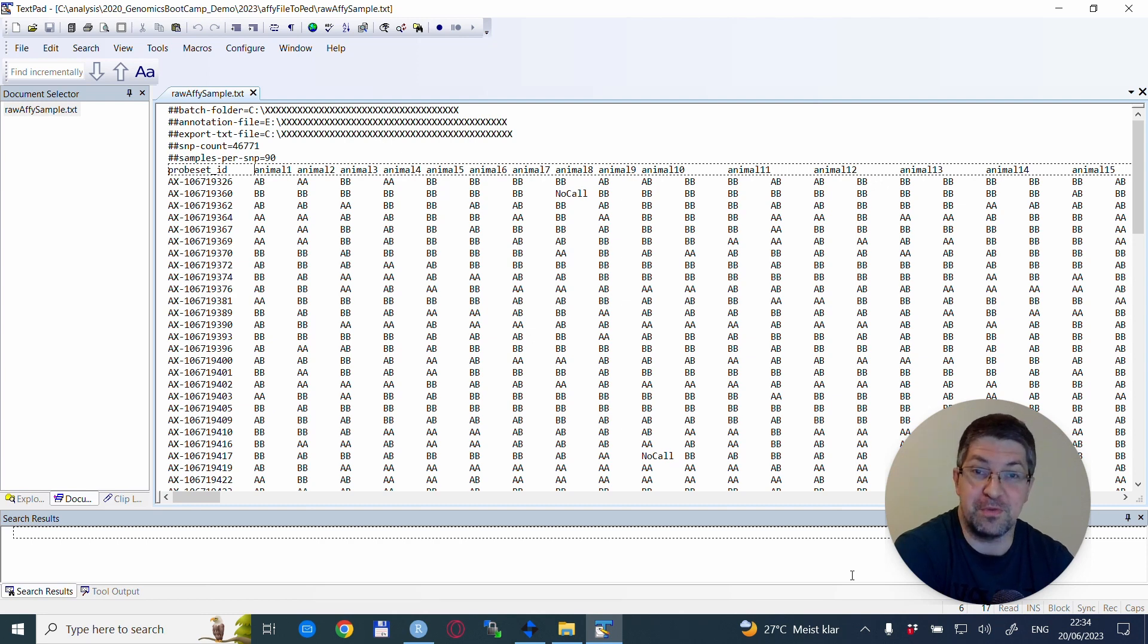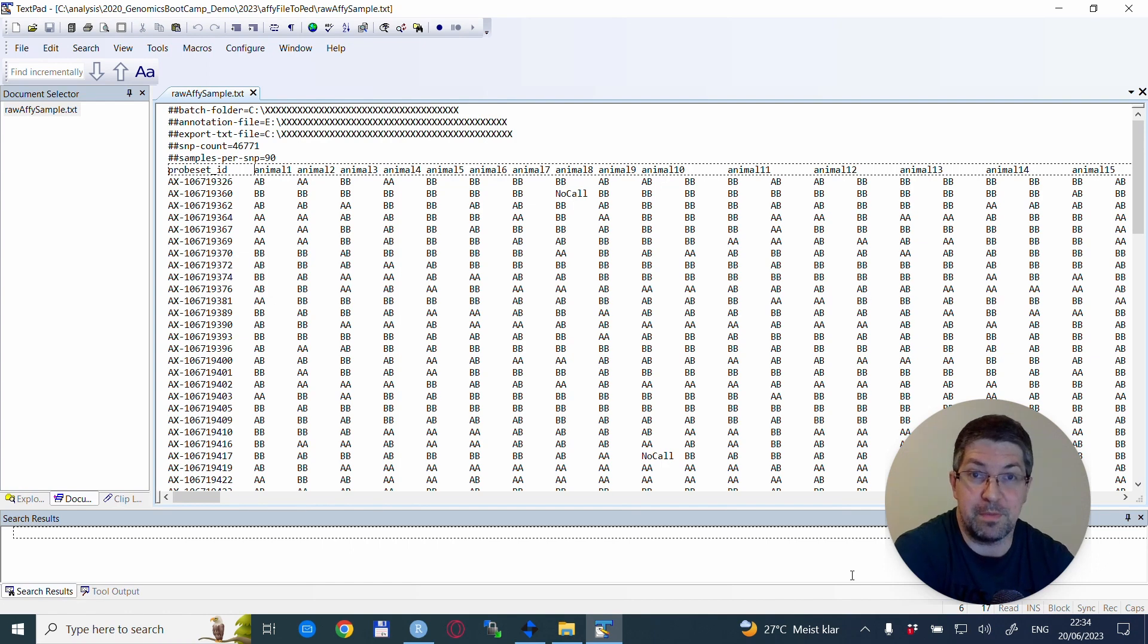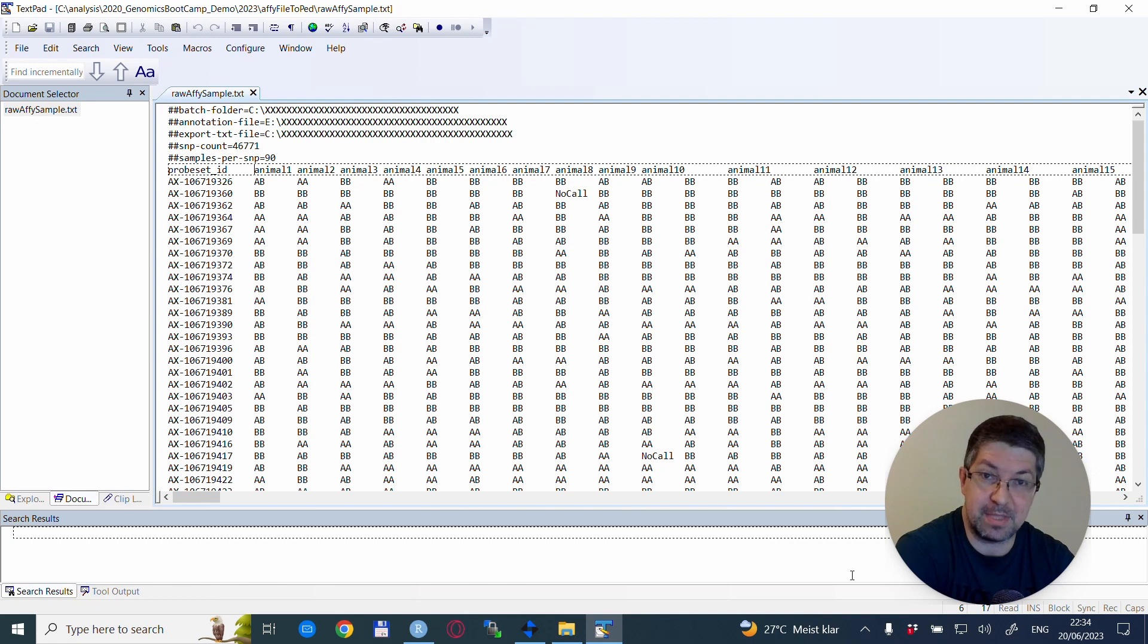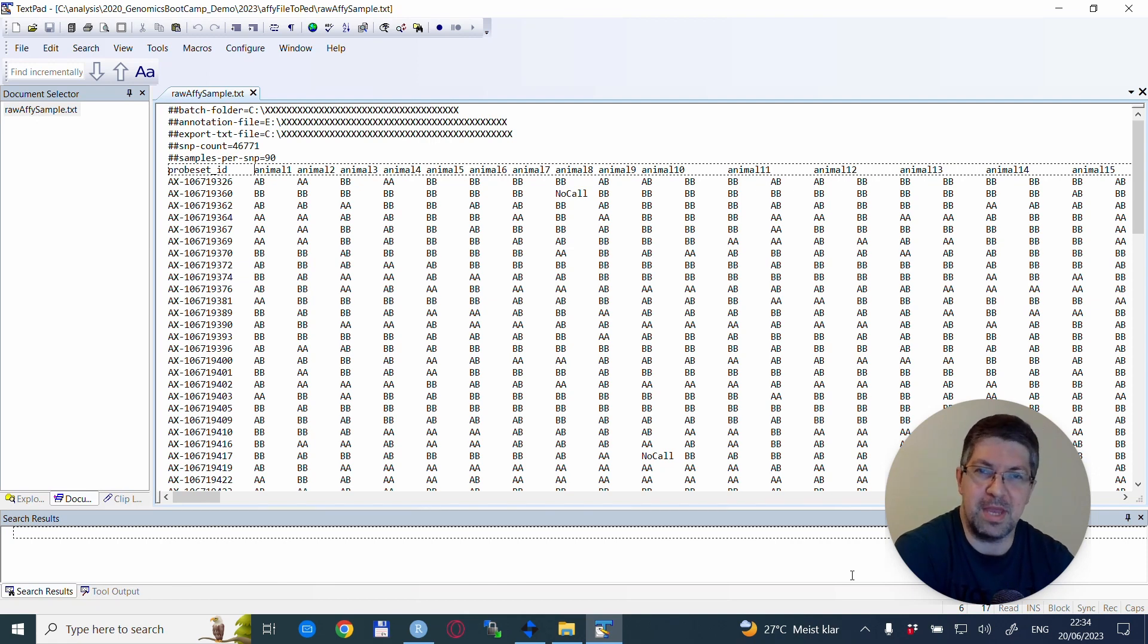This is an anonymized file which will be used for this exercise, or at least for the purpose of showing you how to change this file format to a file format that is acceptable by plink, so you can do many other things with it that plink usually does.